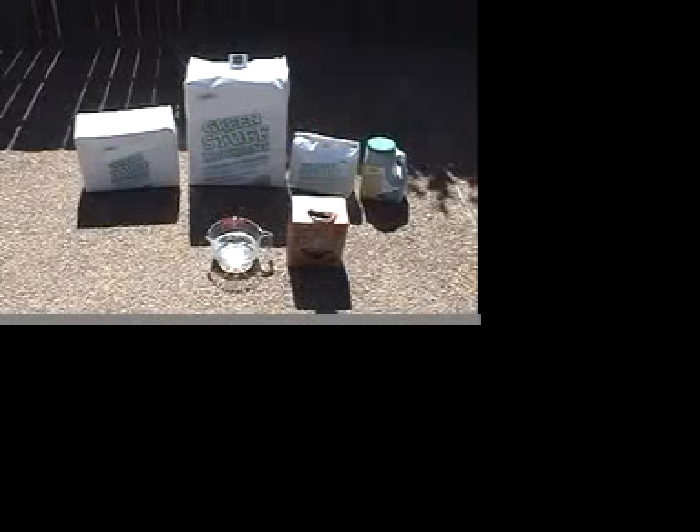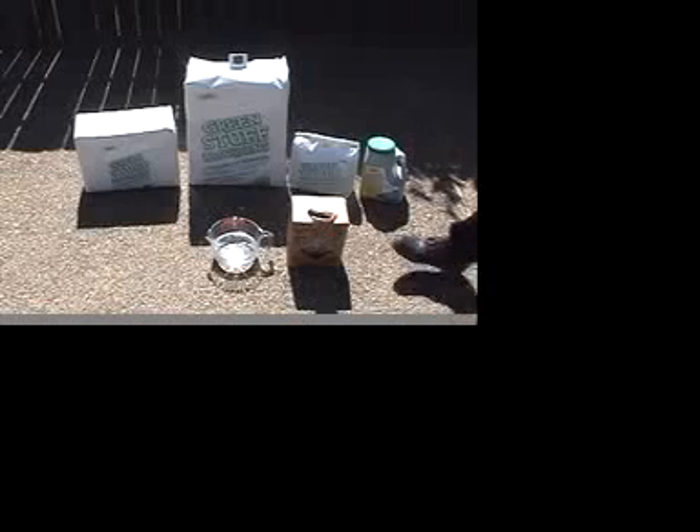This test will show GreenStuff's effectiveness in a sulfuric acid environment. We have one quart of sulfuric acid in a Pyrex container.